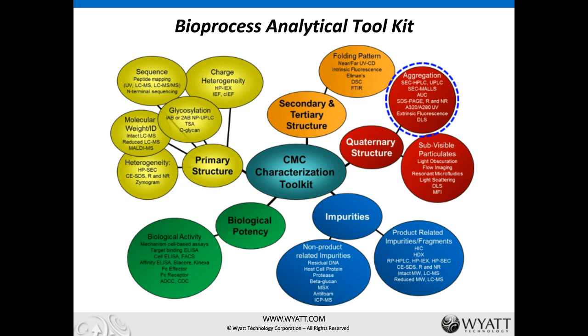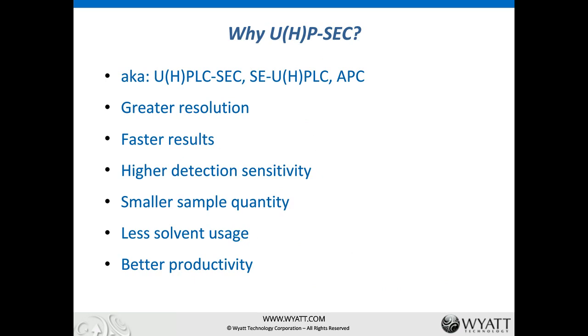The development of SEC for the past few decades, however, has been slow or even stagnant at times until the recent introduction of UHP-SEC by Waters Corporation a few years ago, approximately 2011 for biopolymers and 2013 for organic polymers. Okay, so let's talk a bit about UHP-SEC, or ultra-high performance SEC. The most distinct feature of UHP-SEC is the usage of much smaller silica beads, about 1.7 to 2.5 microns, as the matrix of the stationary phase, compared with the 5-micron beads used in the conventional HPSEC technology.